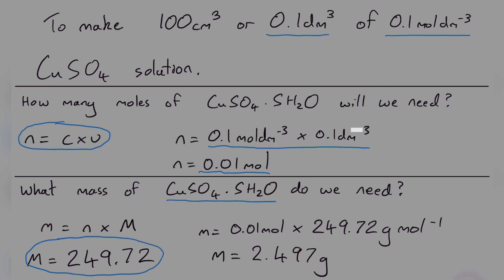To calculate the mass we use the equation: mass equals number of moles multiplied by molar mass. So 0.01 moles multiplied by 249.72 grams per mole gives us a mass of 2.497 grams. So we'll weigh out 2.497 grams of copper sulfate pentahydrate.